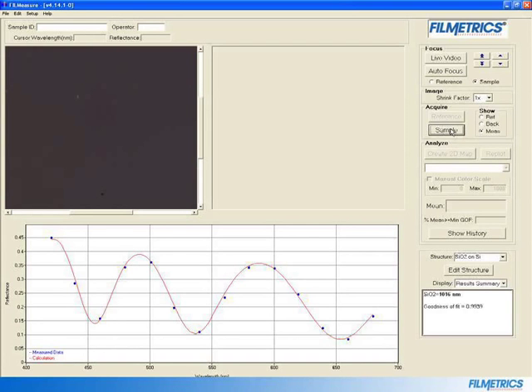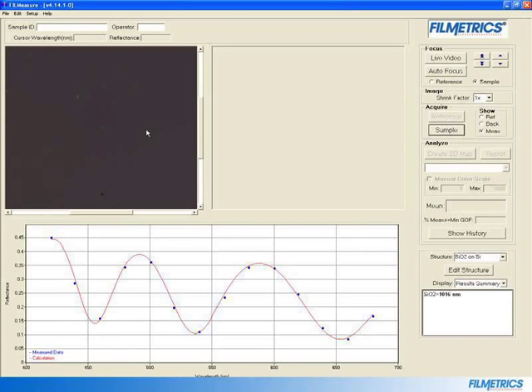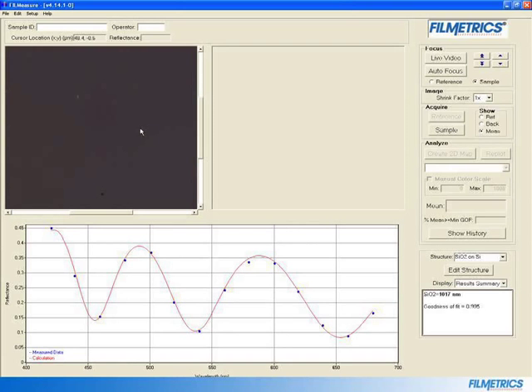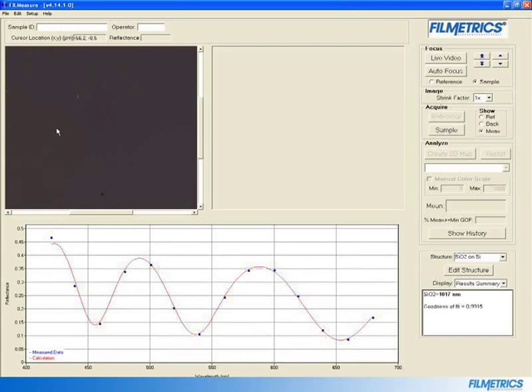Note that you are now no longer in Live Video mode. Try clicking around the video portion of the screen. You can see that spectra has been obtained for every pixel in that screen.